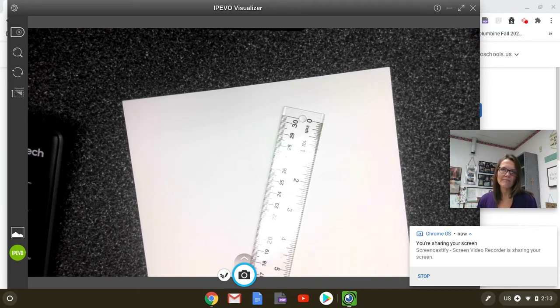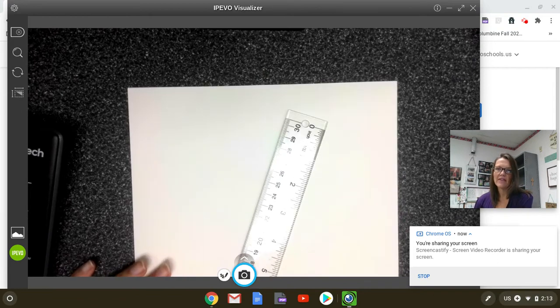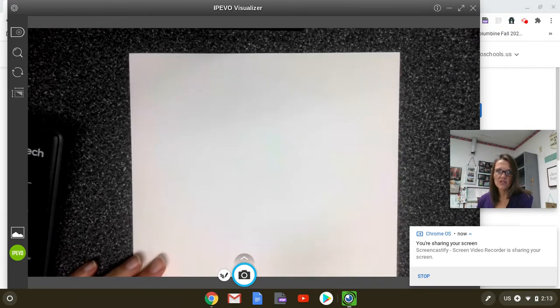And then I also want to take a moment to familiarize you with the general functions of each of the pieces of equipment. Okay. I would recommend that you get out some paper so that you can take some notes so that you have this to reference. You're going to need it for your assignment that goes along with this video.